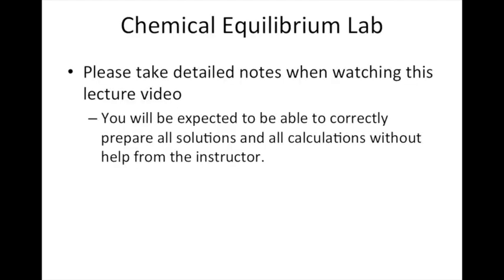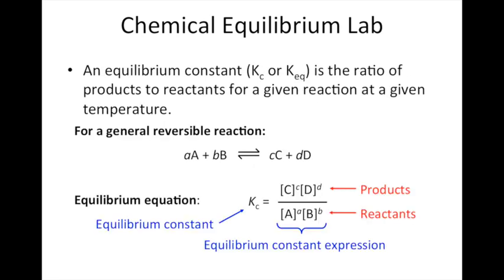In this video, we're going to discuss how to perform the chemical equilibrium lab. Now, while watching this video, please take careful detailed notes. Each student will be expected to be able to correctly prepare all their solutions and all the calculations without additional help. So please pay attention, and if we go too fast at a certain part, please pause and rewind the video. So let's get started.